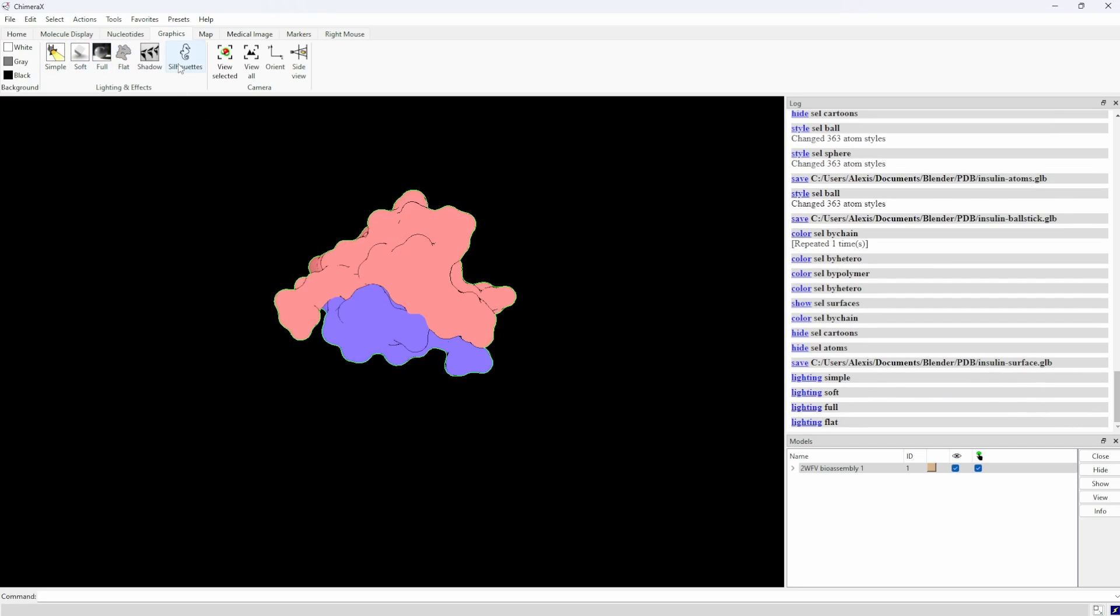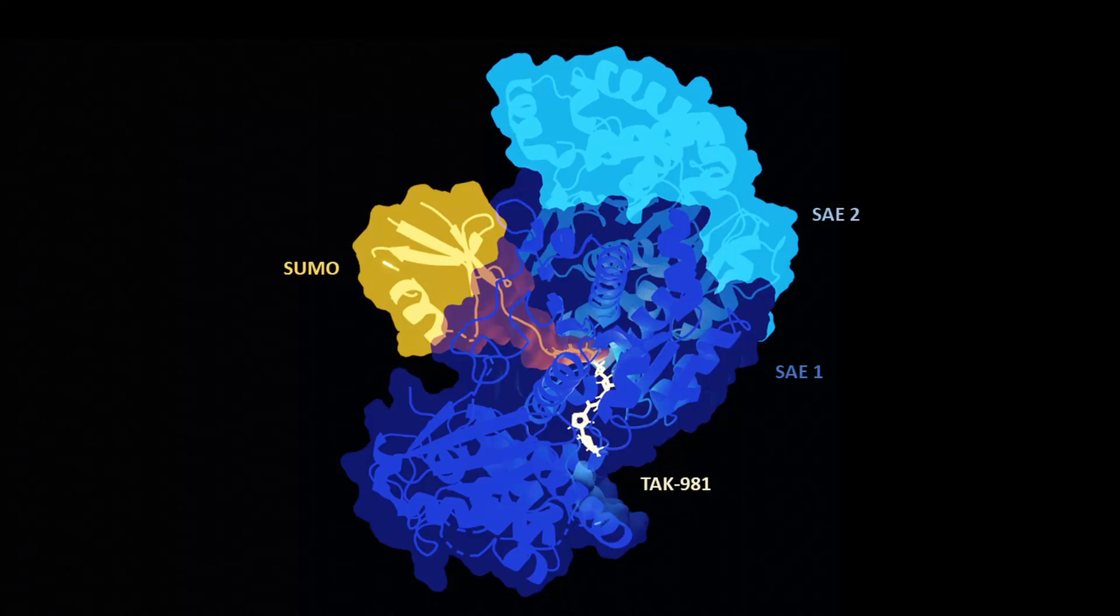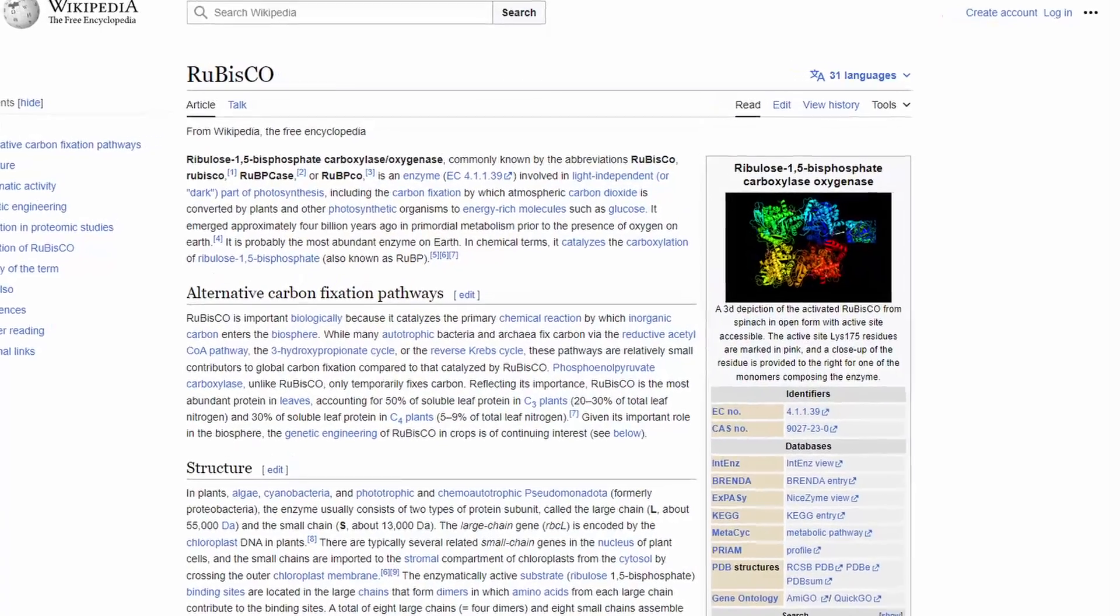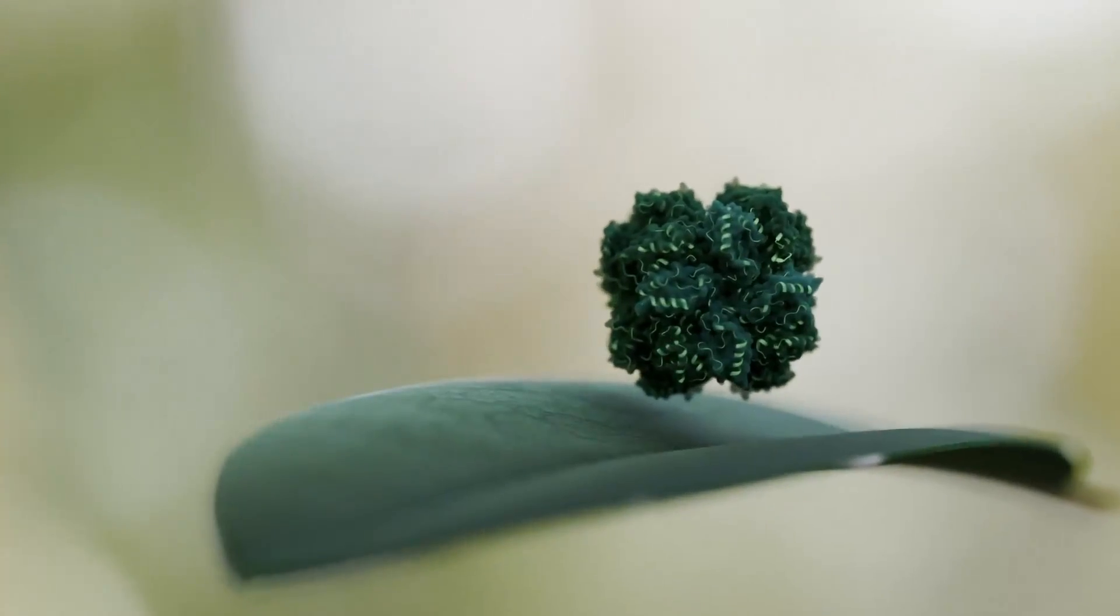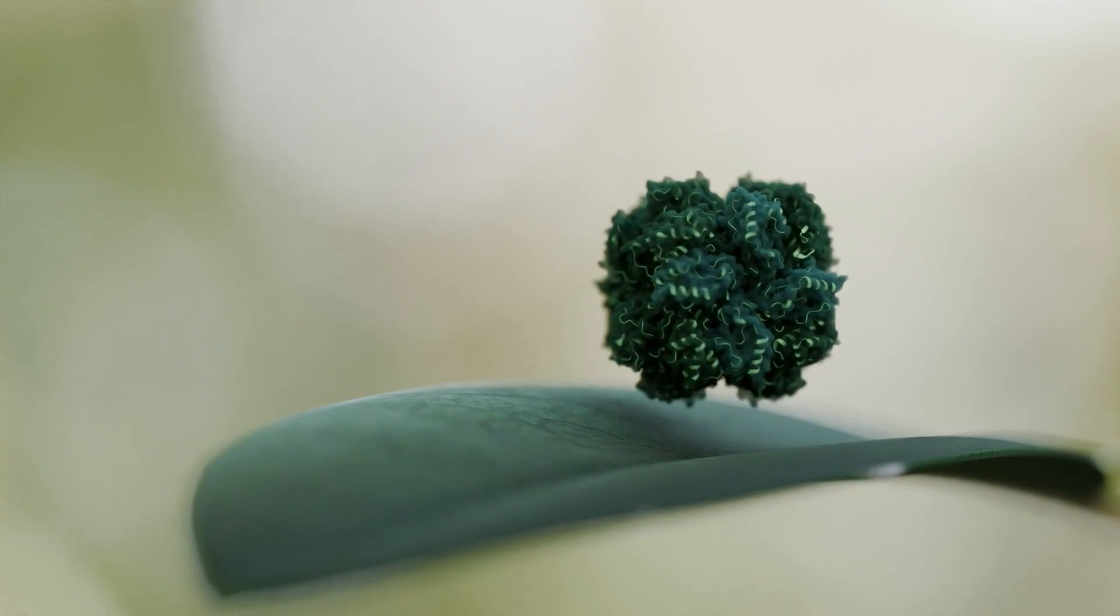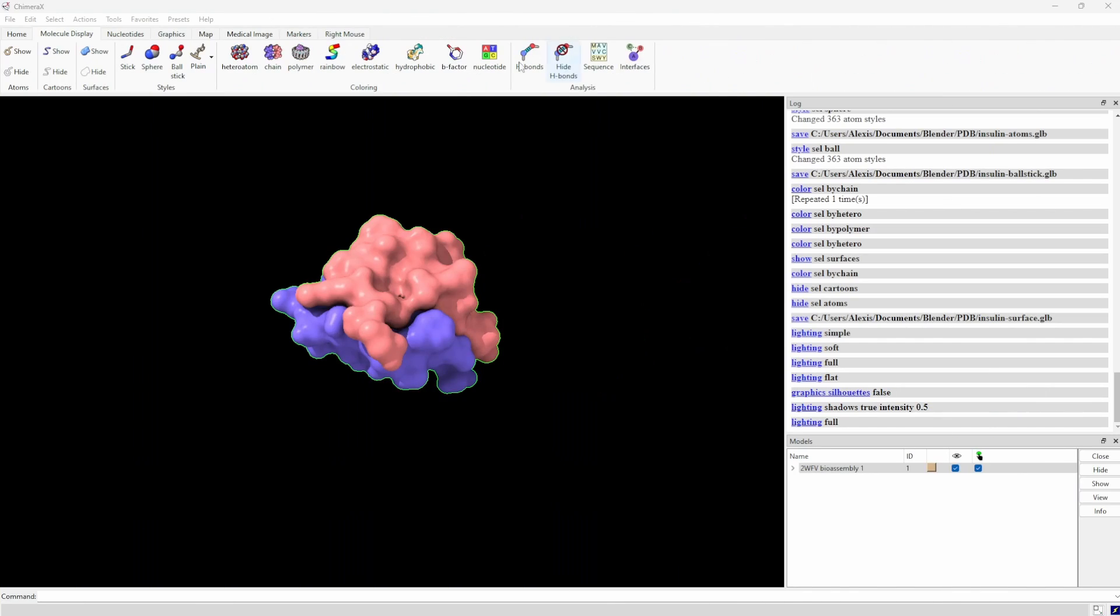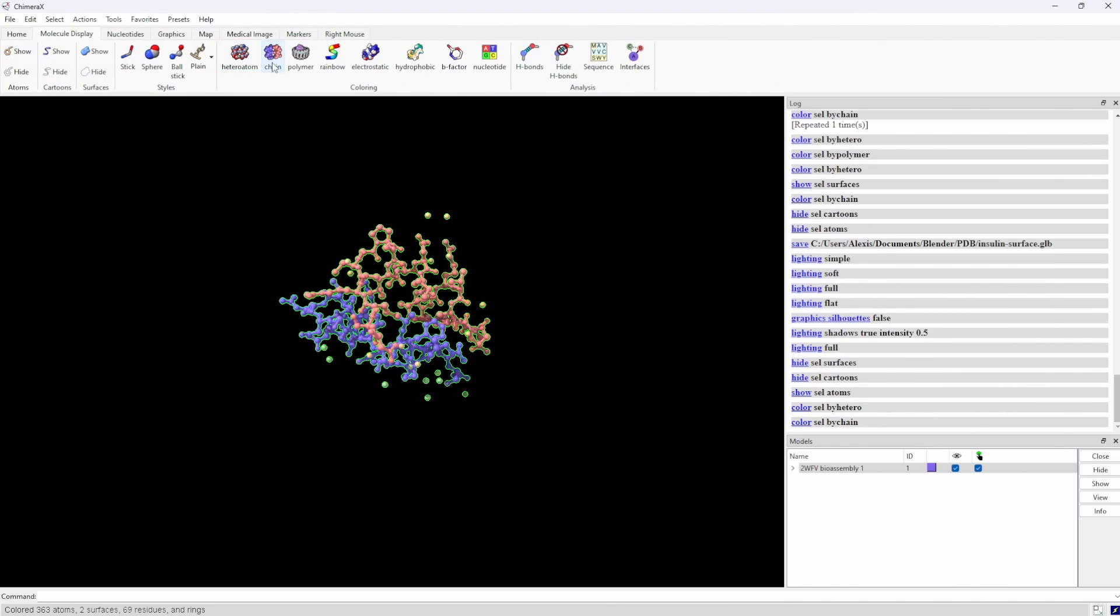But let's say that you want something more, something artistic. Let's say that you want to put Rubisco on a leaf in the tropical rainforest. Now, that you cannot do, and this is why we want to transfer it into Blender.